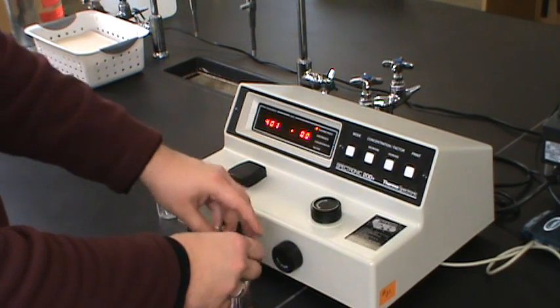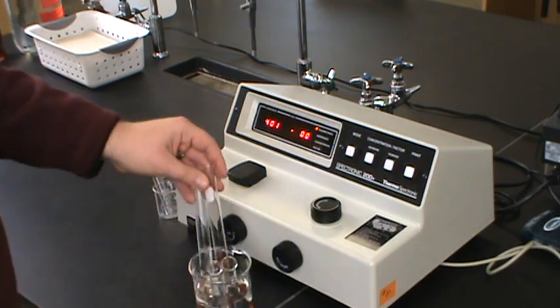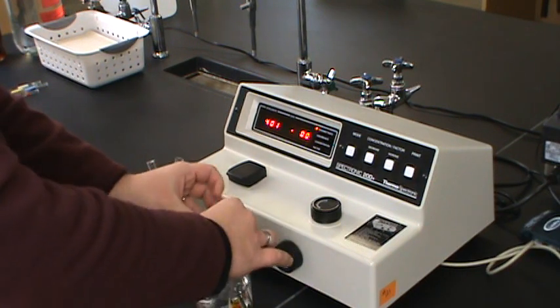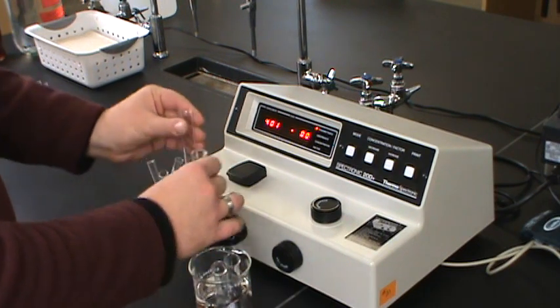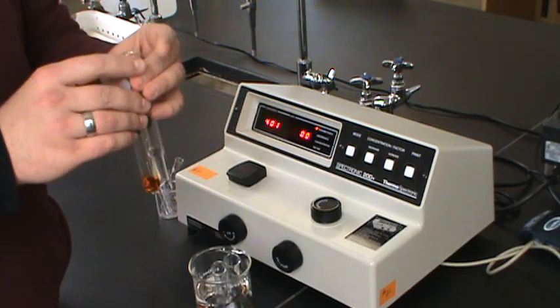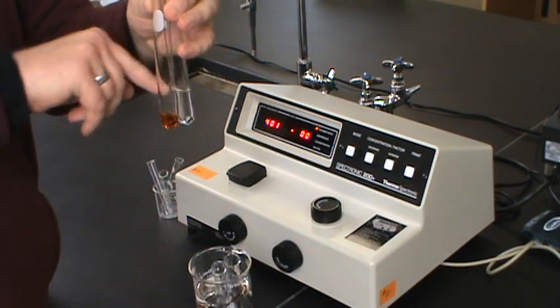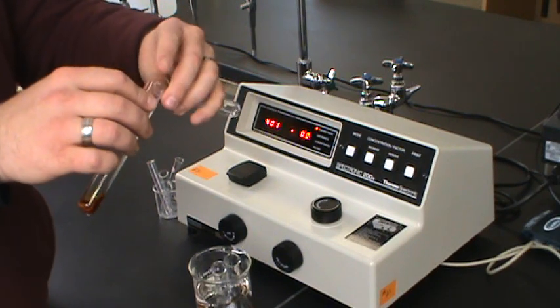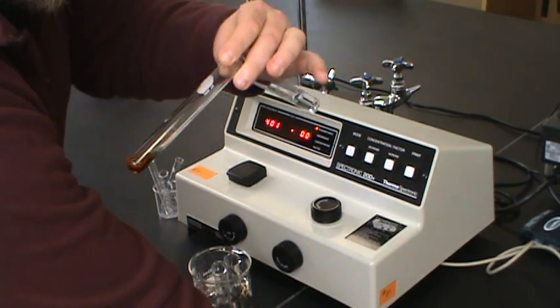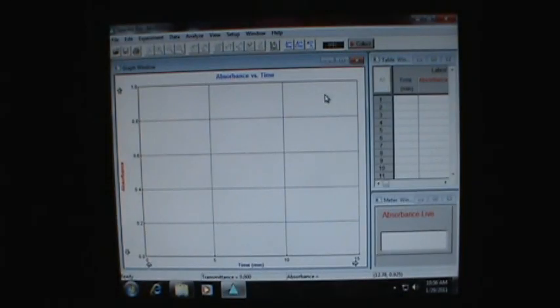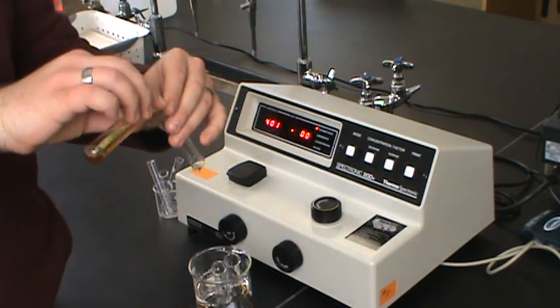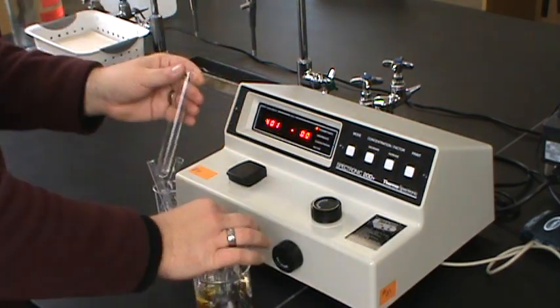So now I'm ready to mix my first sample together. I calibrated the hundred percent while we were looking at the computer. Here's one set of tubes, an iodine tube and a non-iodine tube for run one. They've been in the room temperature bath. This is one place where having a lab partner is kind of convenient because we want to mix these two tubes together and hit collect on the computer at essentially exactly the same time. So I'm going to get the mouse ready on the collect button. I just clicked, there I mix. Pour these back and forth two or three times.